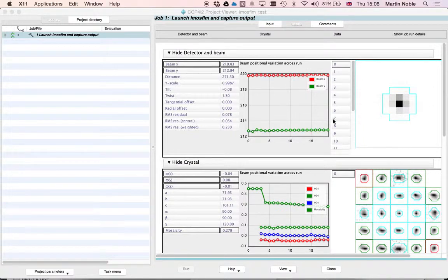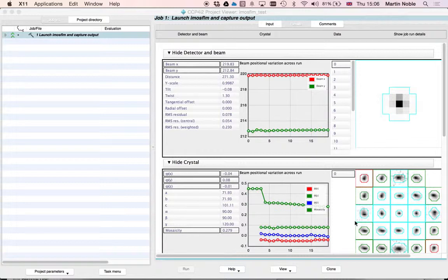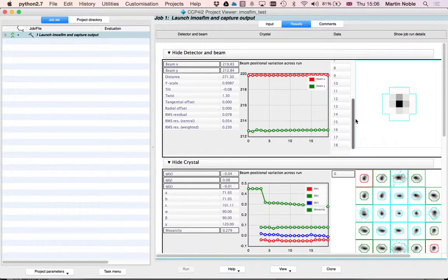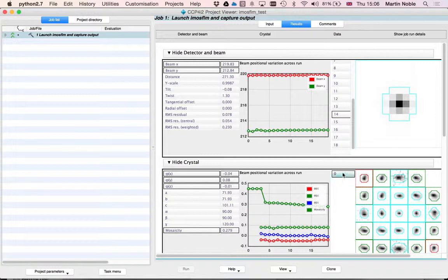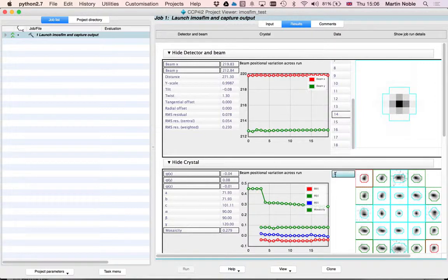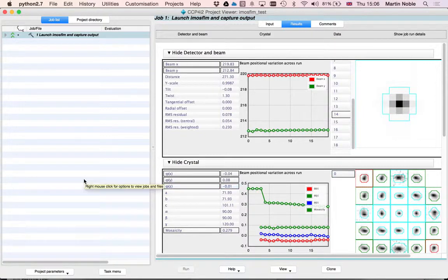The frame by frame analysis of the central spot, and here some compiled profiles in the single block of images that was integrated and processed.